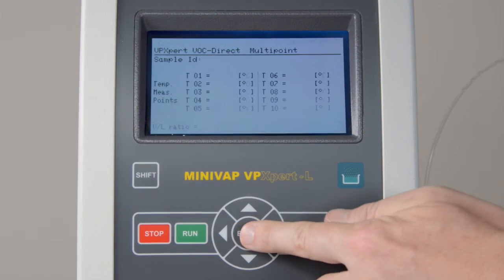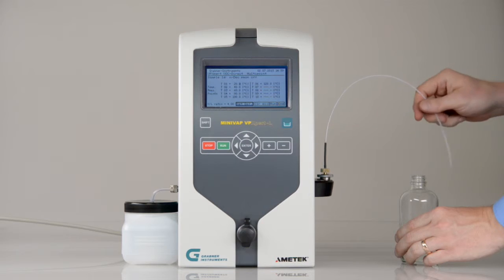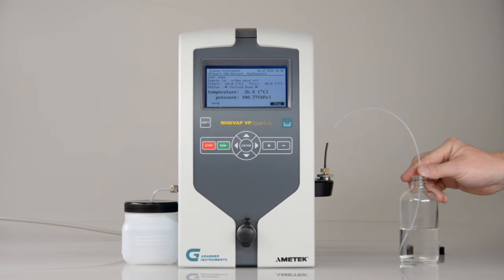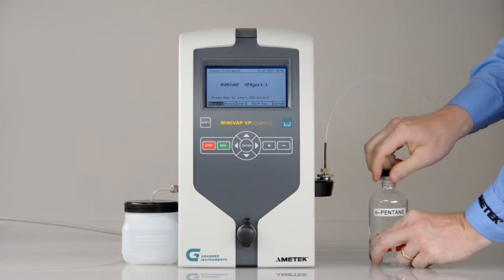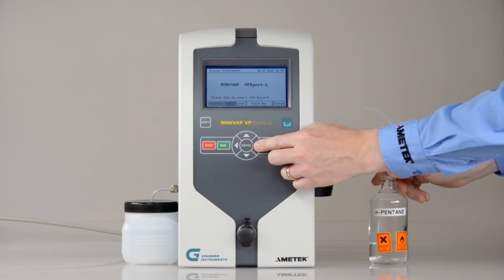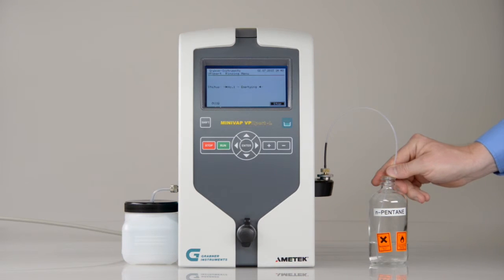To perform a multipoint measurement, select the temperature points. Next, put the tube into the sample, then run the program. The absolute vapor pressure will show directly after the test. Proper rinsing is of utmost importance for low volatility measurements. Start a rinsing cycle for cleaning, and finally do a rinsing with air. Now the instrument is ready for the next measurement.